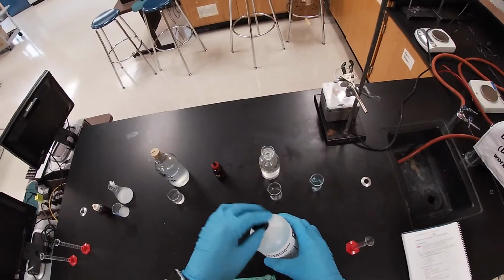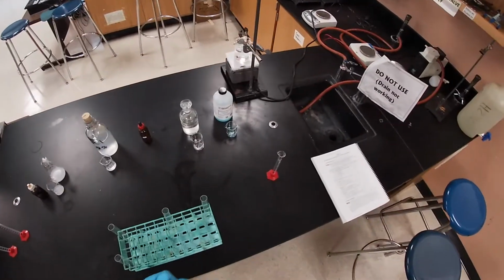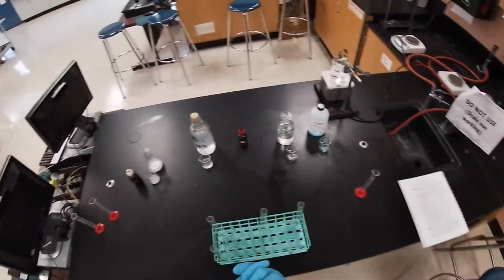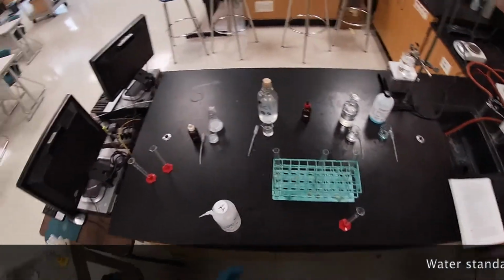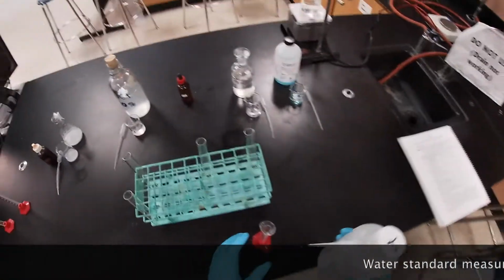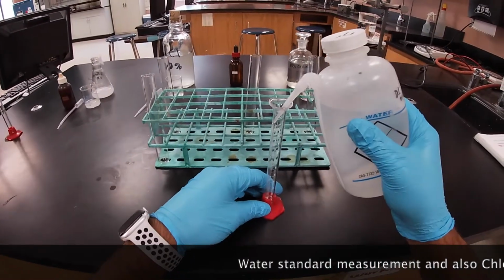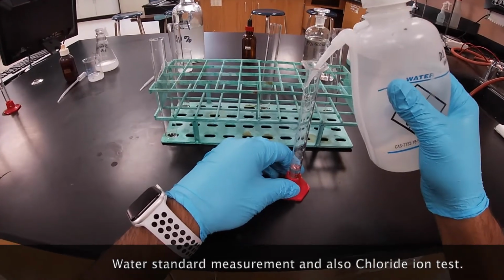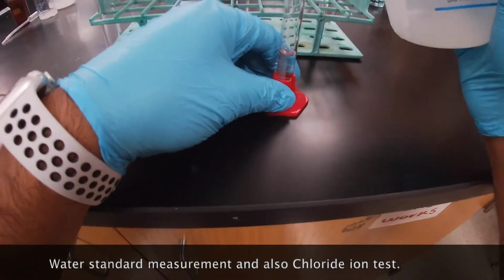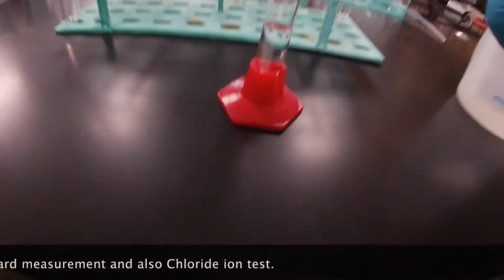All right. So now that I've poured all my solutions, the next thing that we're going to do is look at our chloride test, right? The first thing that we're going to do is measure out 3 milliliters of water, and this will be our standard. The only reason why we're measuring out 3 milliliters of water is so that we don't have to continuously use a graduated cylinder. So we're going to measure out approximately 3 milliliters of water.